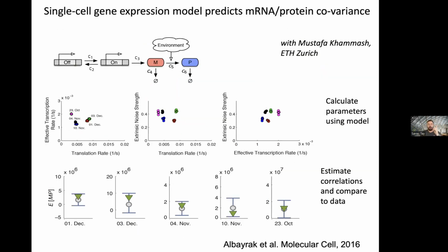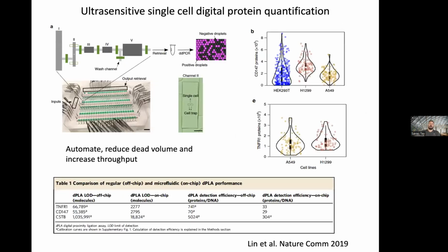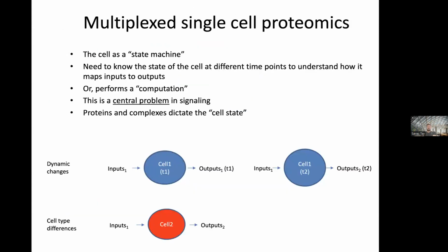Okay, so this is an experiment and computational study of only one protein. And of course, in mammalian cells, like human cells, you have thousands of protein species that are expressed. It would be wonderful to be able to measure as many proteins as possible to have a better understanding of the entire system. And perhaps we can even develop a fully calibrated computational model of these large-scale networks like NF-kappa B and many other signaling pathways, all in single cells. Now, to do that, we developed a technology which we call proximity ligation, proximity sequencing. At this point, I'm going to talk about that.